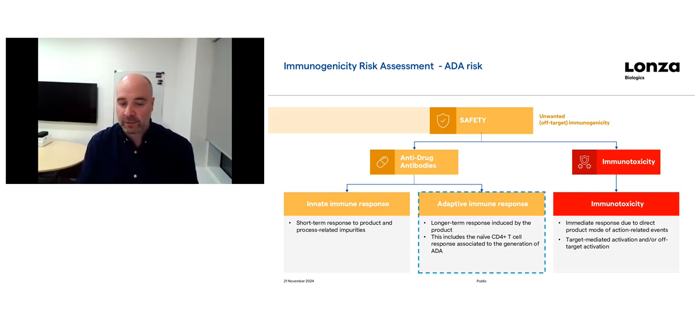So as I said, the assay is very similar to what I just outlined. It's just the sort of controls and test conditions that we include. But that assay works really well for innate immune response. I'll move more now into the adaptive immune response. So this is more kind of following on from the in silico tool.